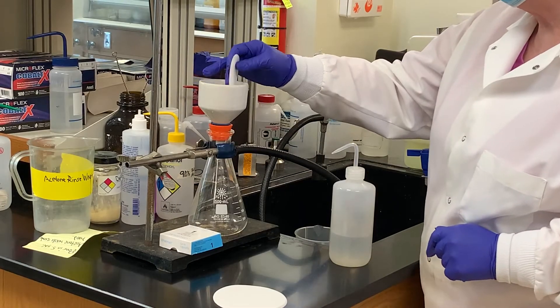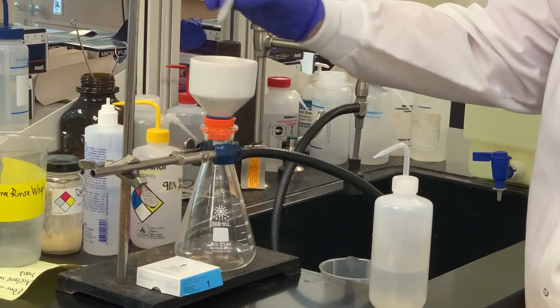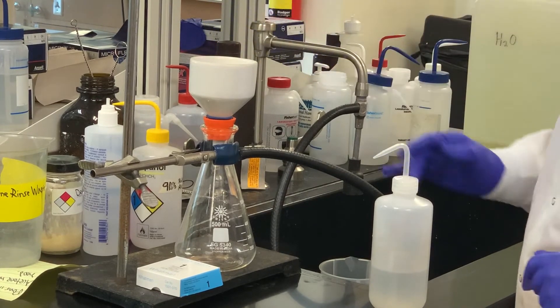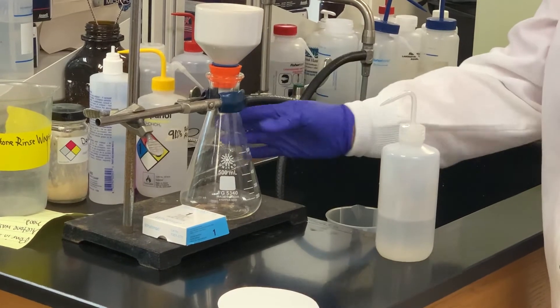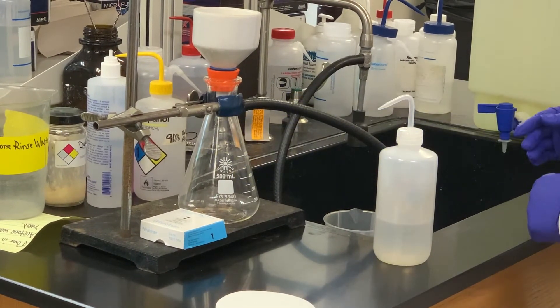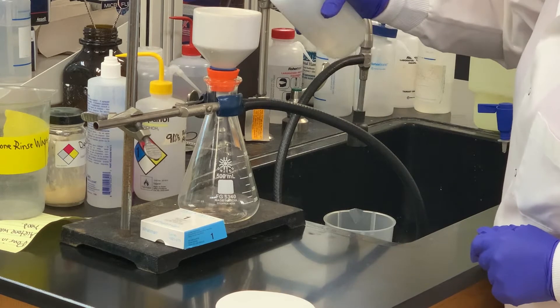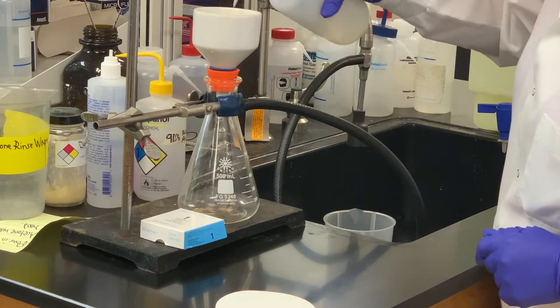I'm getting ready to use the Buchner Funnel vacuum filtration, so again, always use the right size filter paper. I've got the vacuum hose hooked up to the sidearm adapter of that suction flask. We're going to add just enough water to wet the top of the filter paper there.